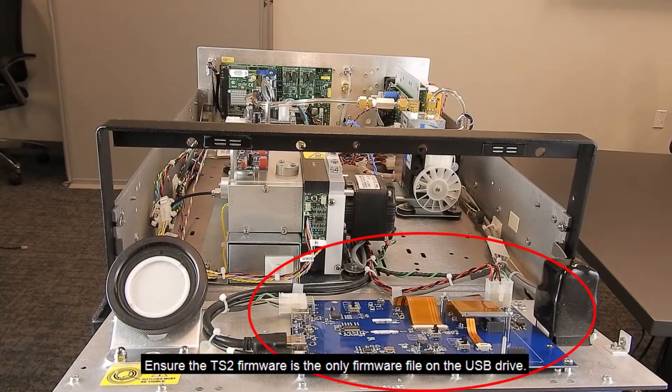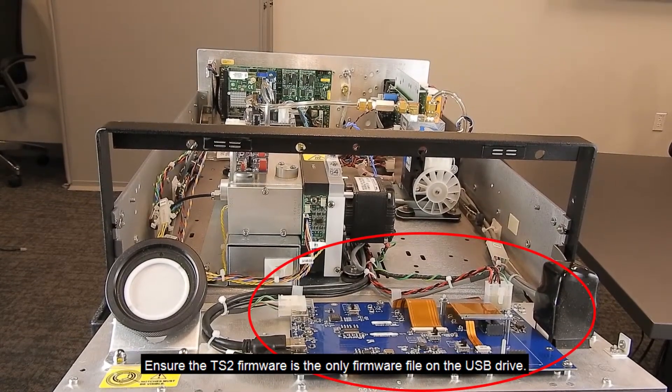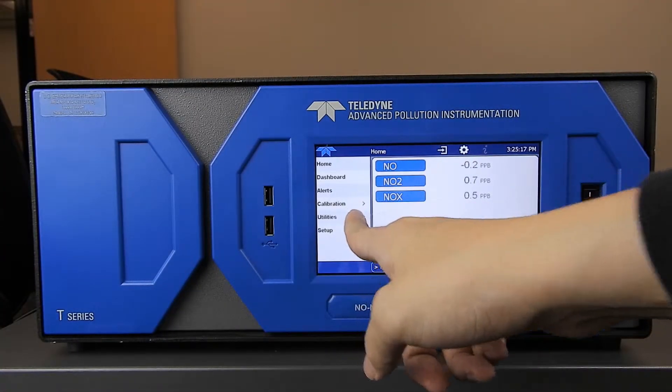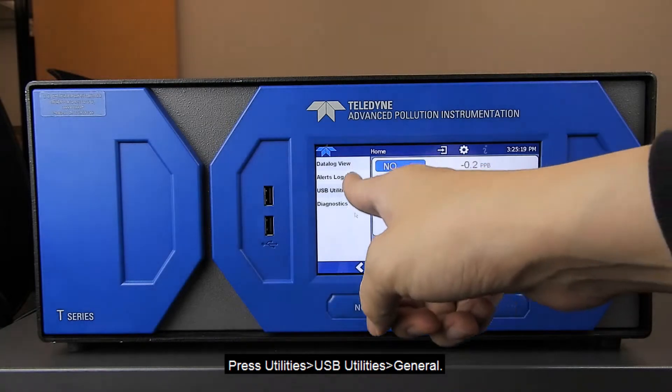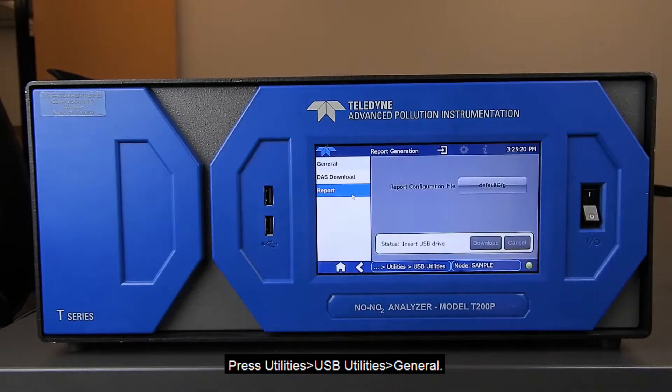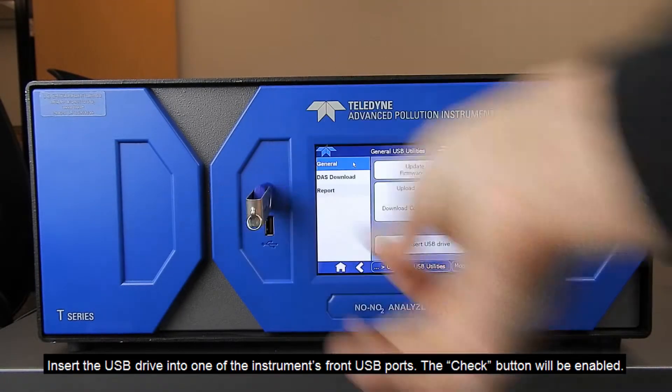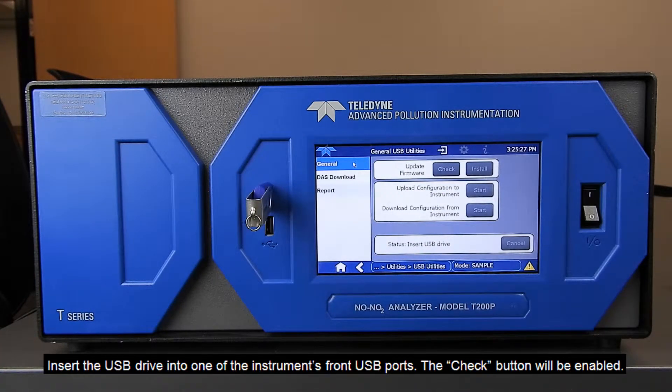Ensure the TS2 firmware is the only firmware file on the USB drive. Power on the instrument. Press Utilities, USB Utilities, General. Insert the USB drive into one of the instrument's front USB ports.